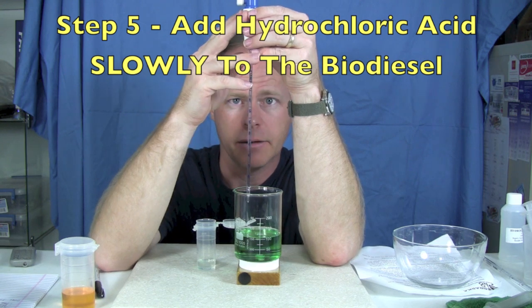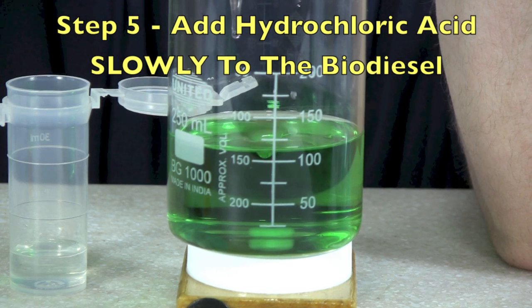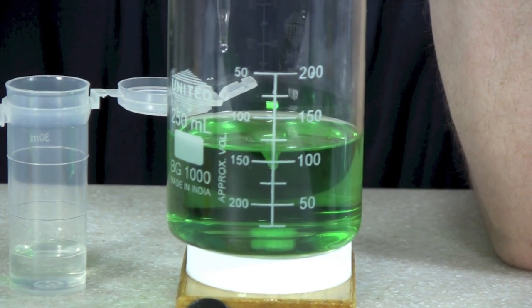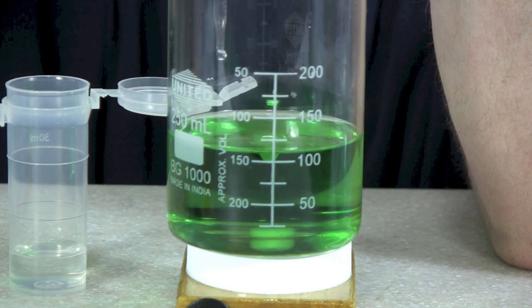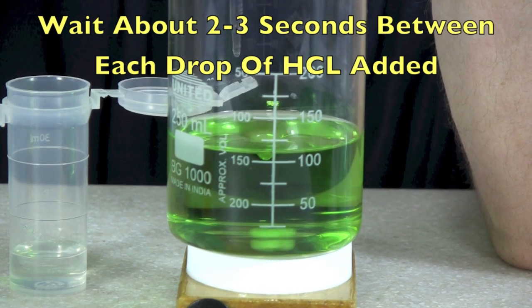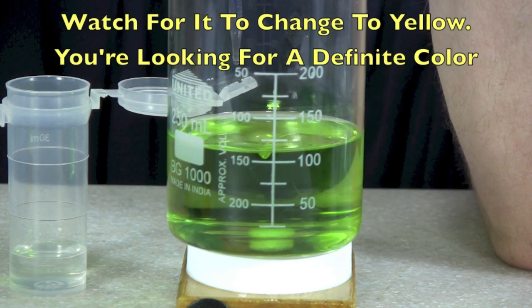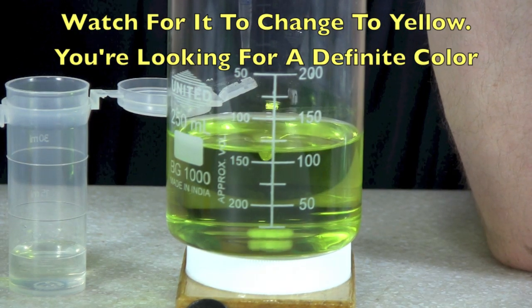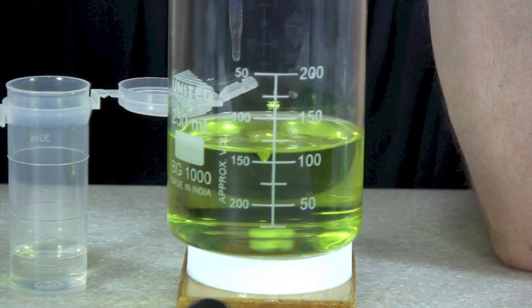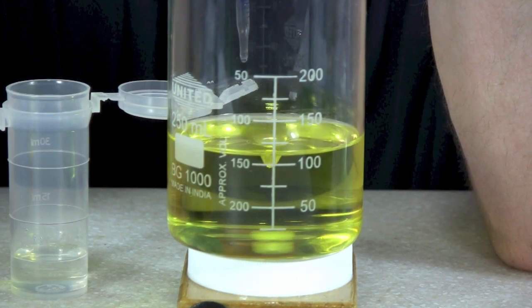When we titrate it really doesn't take much. What we're looking for is a definite color change — right now we're kind of a bluish-green color and we want to see when it goes to yellow. I like to wait about two or three seconds between each drop because it does take a while. I can see it going somewhat of a yellowish color. There it goes to yellow. I have barely put any in at all.